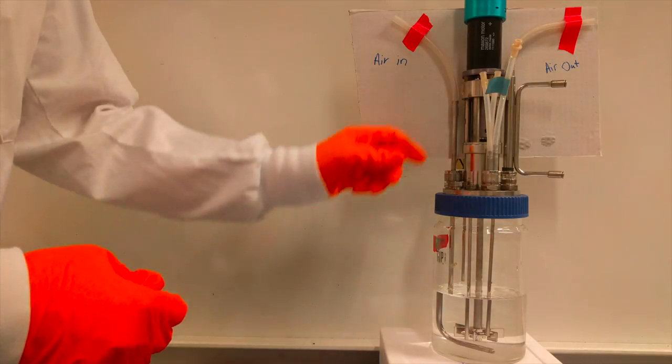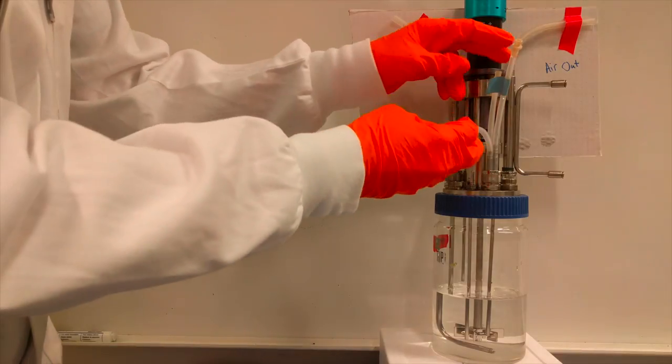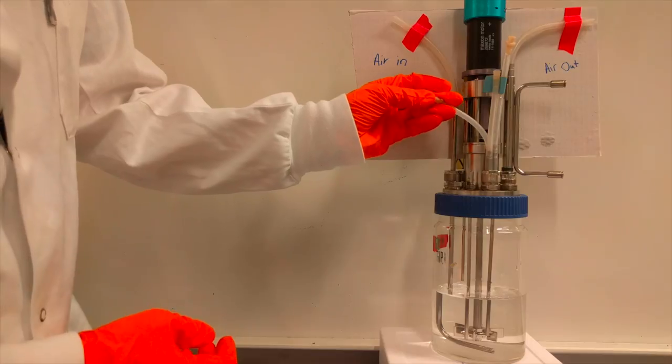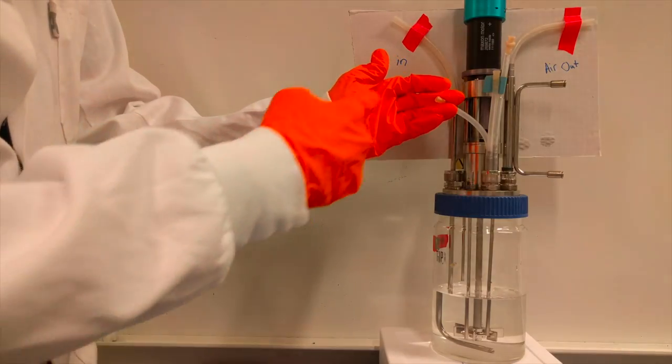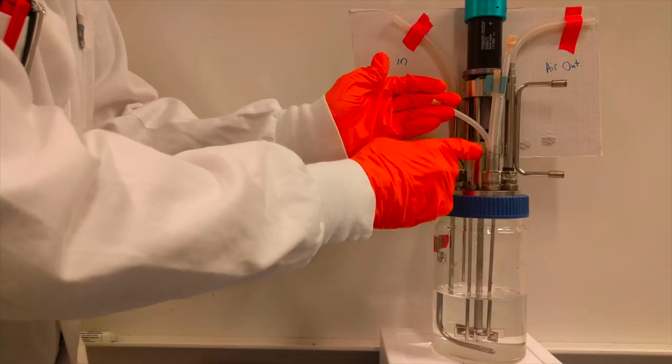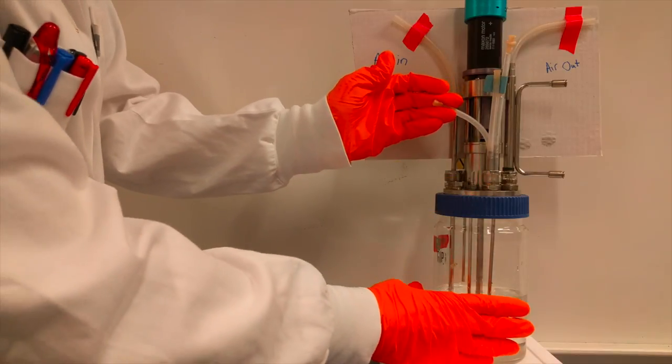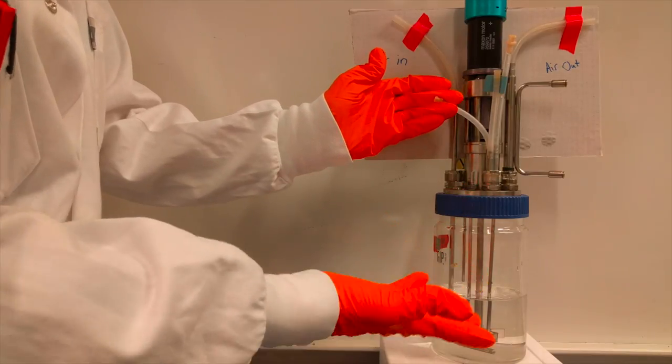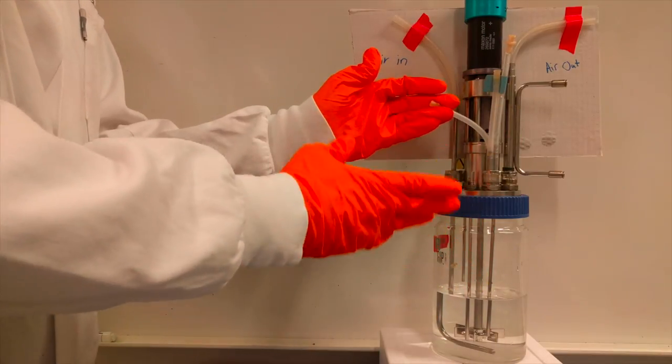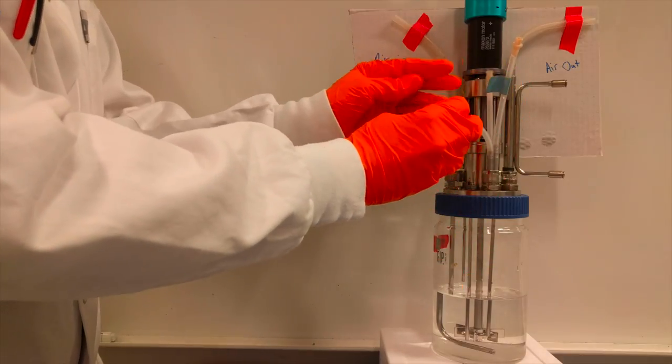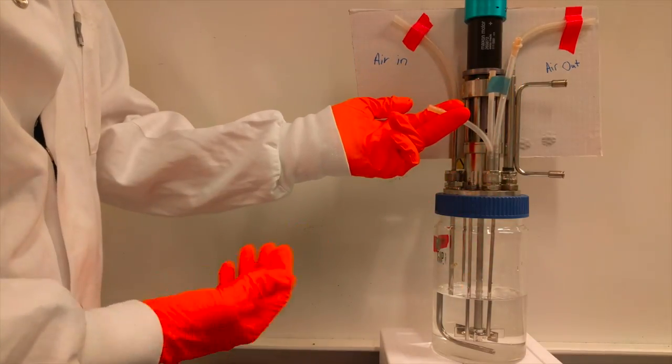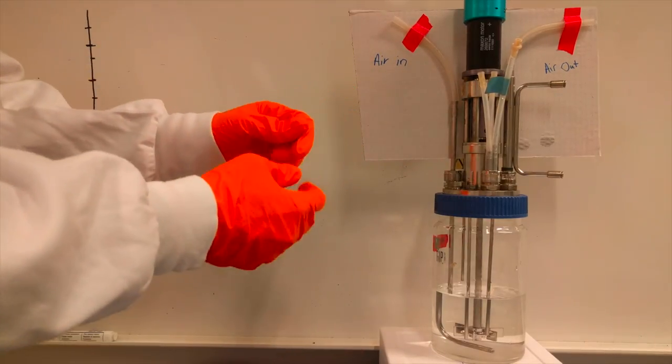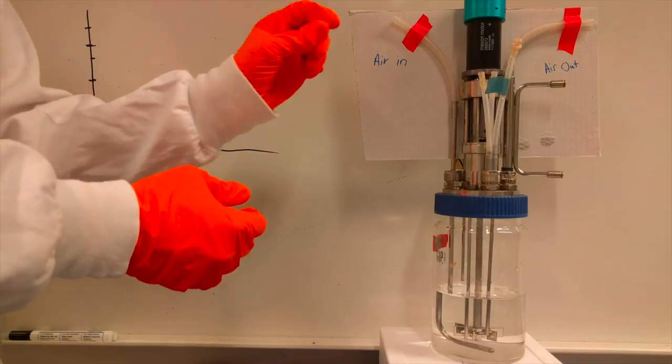The other two tubes you're seeing here are acid and base tubes. For instance, we could call this our acid tube. What we would do is hook a line up to this, and that would allow us to slowly add in acid. If the media starts to become too basic, we can add in a very small drop of acid to lower the pH back to the level that we want. The same thing is true with a tube like this, which is going to be used for base. Both of those are going to be hooked up to small rotary pumps, which allow us to very accurately add a very small amount of liquid.